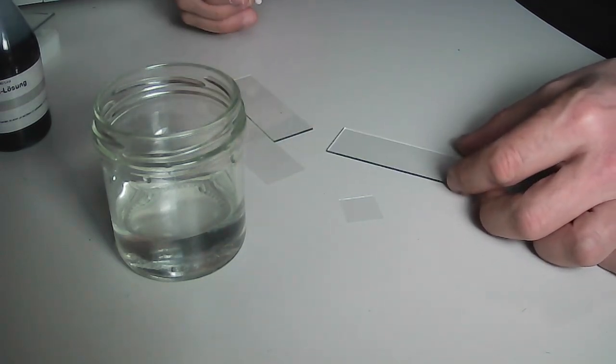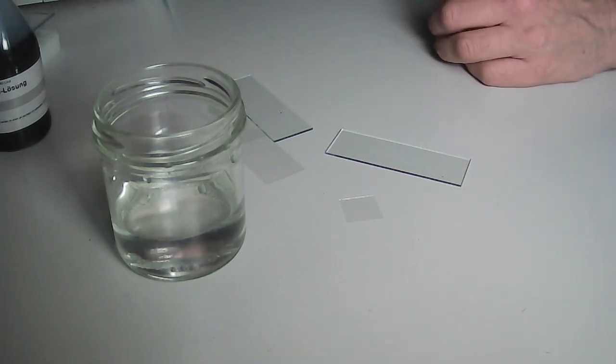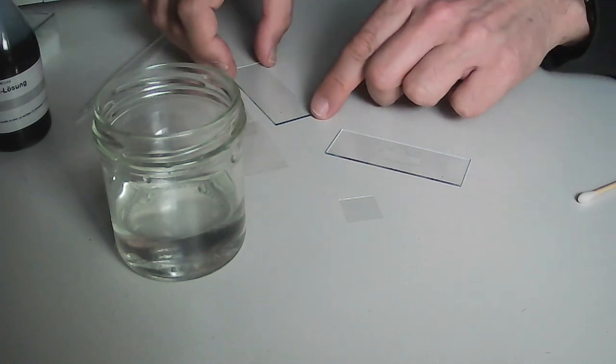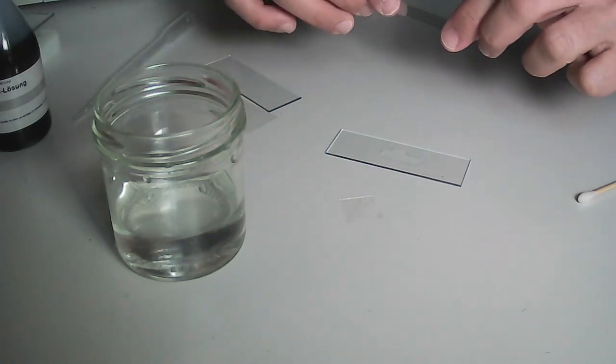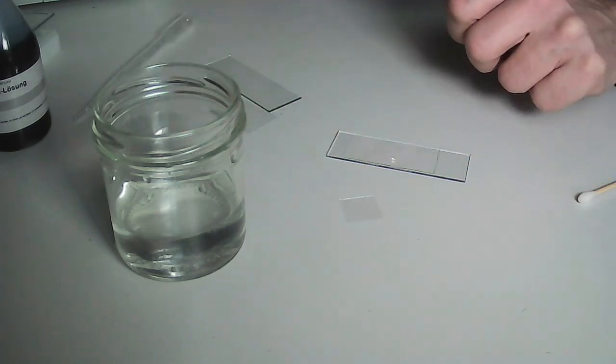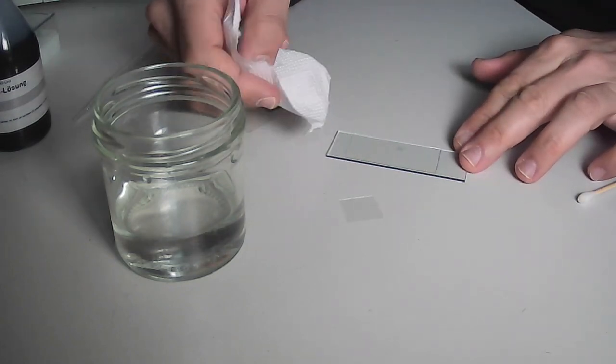And what I'll be doing is I'll simply be adding a drop of water. Okay. And the cover glass goes on top. If I only can pick it up. And all of the excess water, okay, and get some tissue paper here. All of the excess water can be removed.